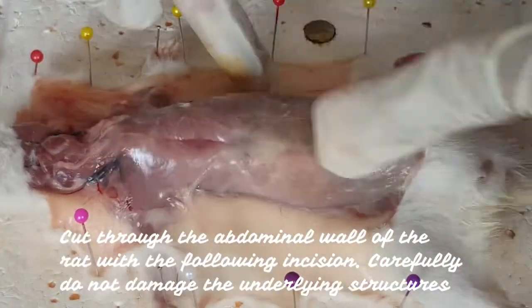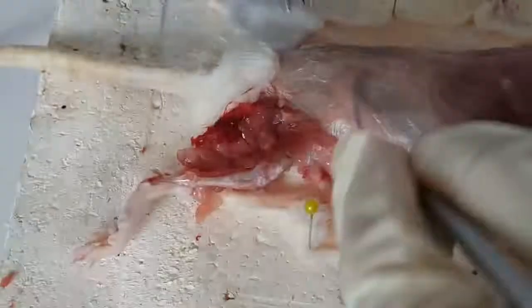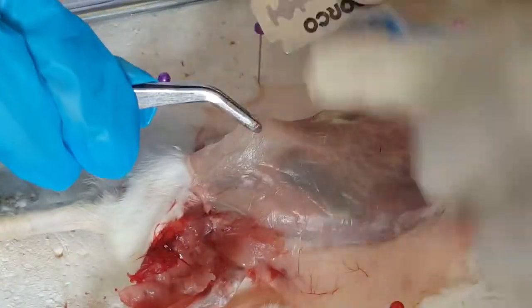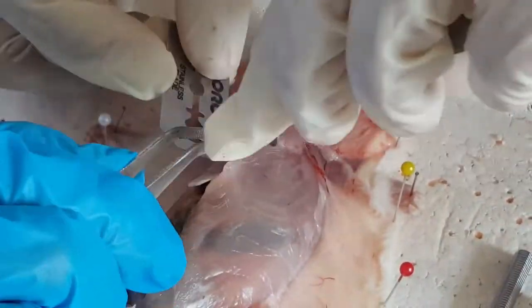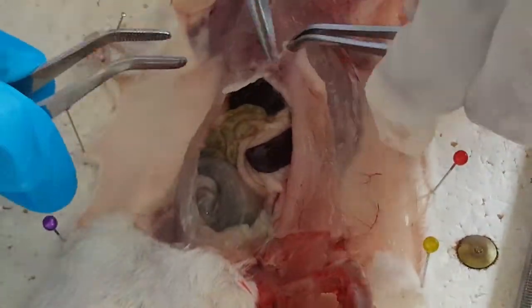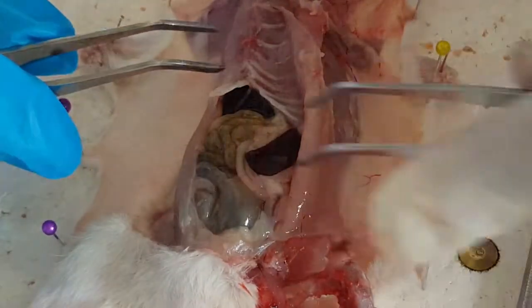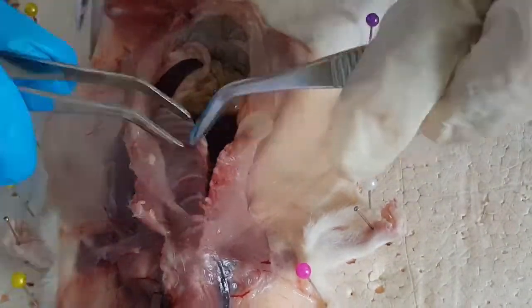Cut through the abdominal wall of the rat with the following incision. Carefully, do not damage the underlying structures. Cut through the rib cage to further expose the underlying organs.